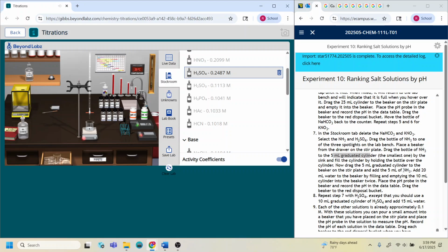And we have to dilute that with 20 ml of water, and we're going to use the 10 ml cylinder twice to fill it. So where's the 10 ml? This is the 10 ml in there, so we're going to fill it completely. Here you go. When it snaps, then it's completely full. So that is the first 10 ml here, and we're going to do the same thing there. This is partially full, so here you go. Now it's completely full.